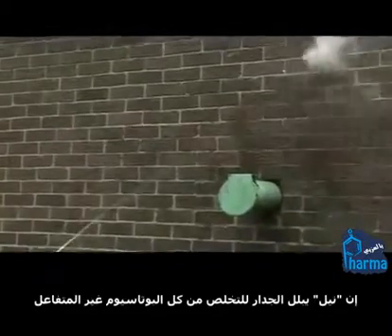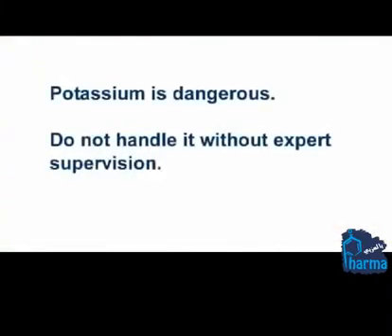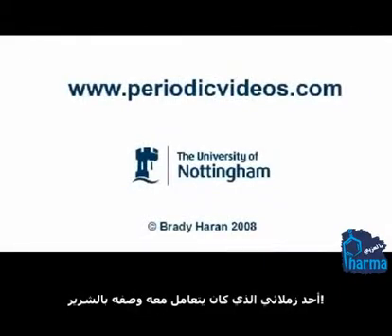As Neil quite literally wets the wall to get rid of all of that unreacted potassium. Oh, wicked! One of my colleagues who used to work with it described it as evil. Again — look at that!